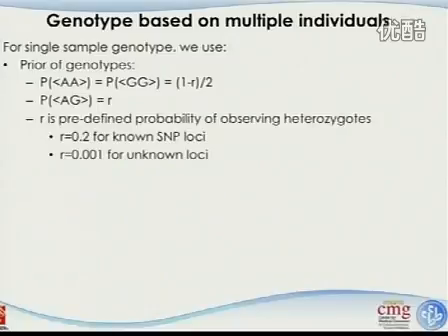So this became a very active research area, and of course the people in the 1,000 Genome Consortium had to figure that out. Going back to this single sample, single individual genotype, these are the priors of the genotype. I made the comment that in the Bayesian type of approach, they always need to make a prior, which is some type of assumption that they hope is right.